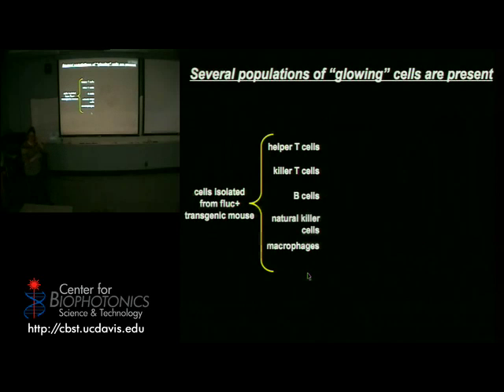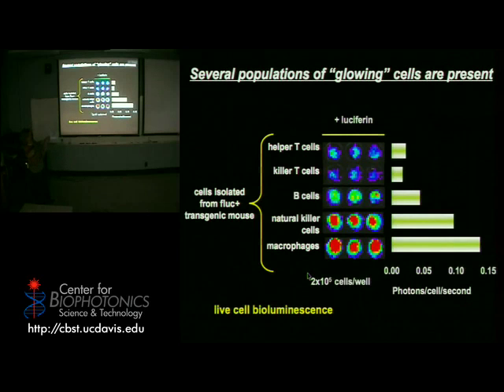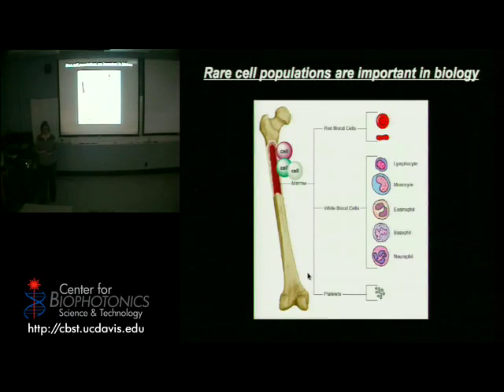Within these transgenic animals that we had created with luciferase in every single cell, I'm showing you here a collection of cells that we took out of those animals just to see if all of these cells were glowing, if they had light emitting properties. And they did, all to a certain extent. I'm showing you them just sitting in the dish again and dumping luciferin on them, and then we're recording the light emission. And the actual light emission is represented by these bars here and just visually within the middle well. They all had different extents of luciferase protein in them, but they were glowing enough that we thought we could use them to study certain things like bone marrow transplants.